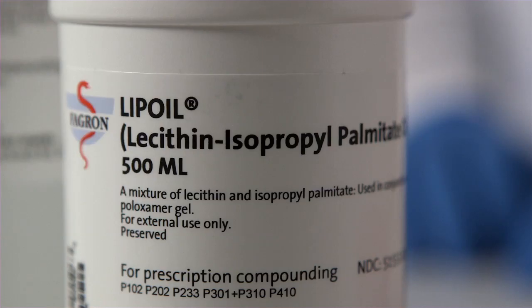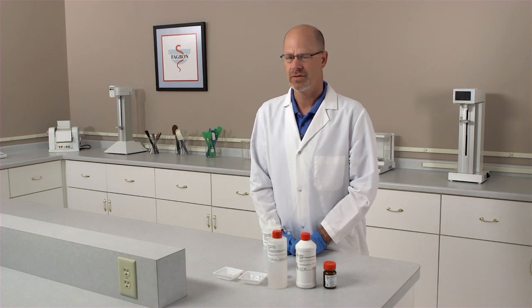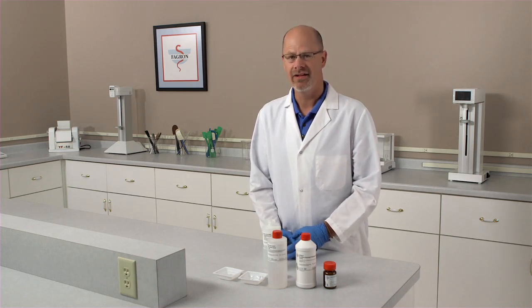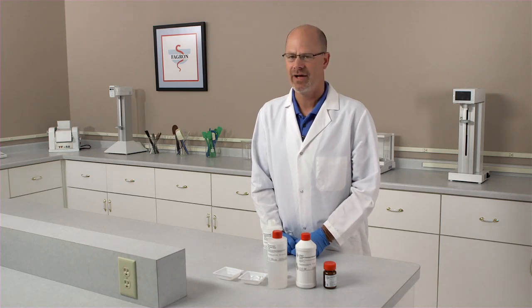The next ingredient we'll look at is the lip oil. This is a combination of lecithin and isopropyl palmitate. This is a penetration enhancer. So the thought is, if you have a nice occlusive gel, let's put a penetration enhancer in. This is where the PLO gel system really has some value.